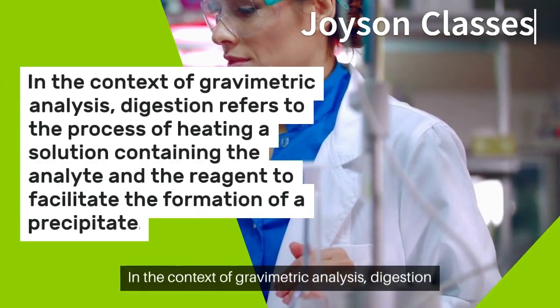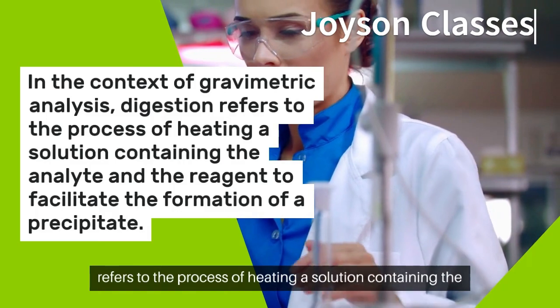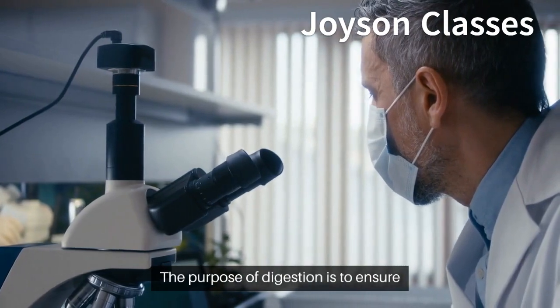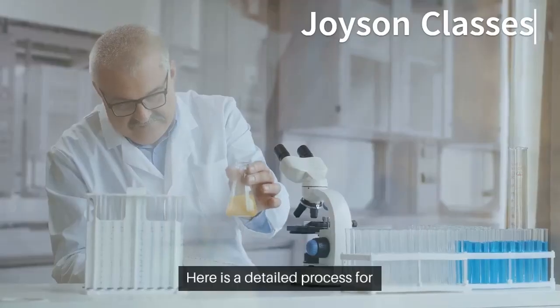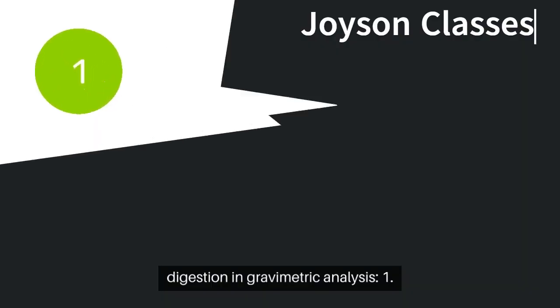In the context of gravimetric analysis, digestion refers to the process of heating a solution containing the analyte and the reagent to facilitate the formation of a precipitate. The purpose of digestion is to ensure complete and homogeneous precipitation of the analyte, leading to more accurate and reliable results. Here is a detailed process for digestion in gravimetric analysis.